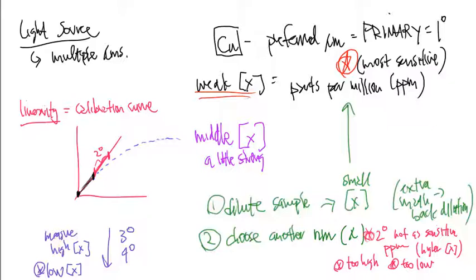So an analyst in a laboratory would look at the setup, and they would have to have an understanding of the sample. How concentrated is the sample that you're given most of the time in the lab? And if your job is to analyze 20, 30, 40 samples at a time, no one is going to go through the process of diluting every single one of those.